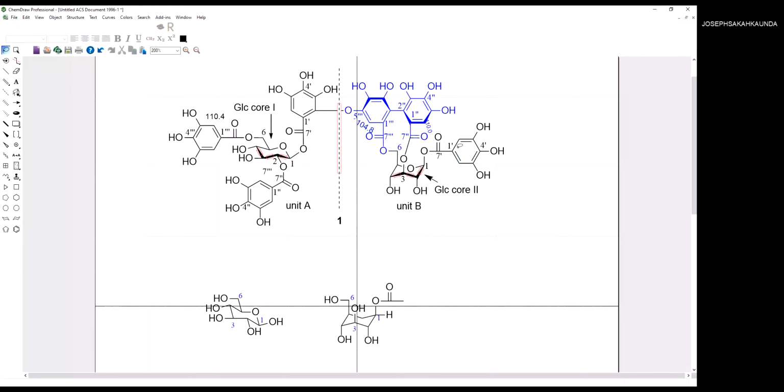Usually, when you want to know that there's symmetry somewhere, you check this proton from HSQC, you know which proton corresponds to which carbon. So let's say, for example, that the carbon here, let me just guess something. Let me say 126.7.